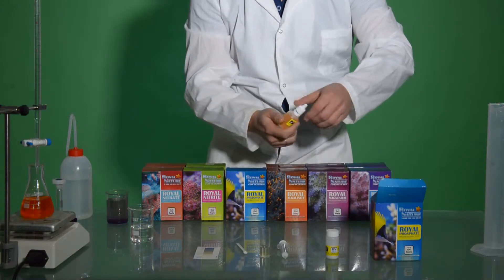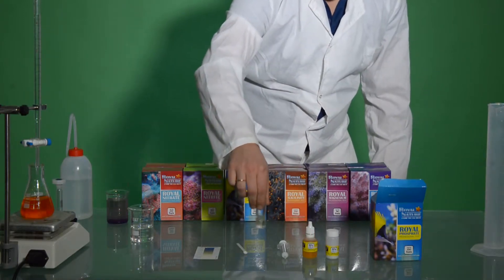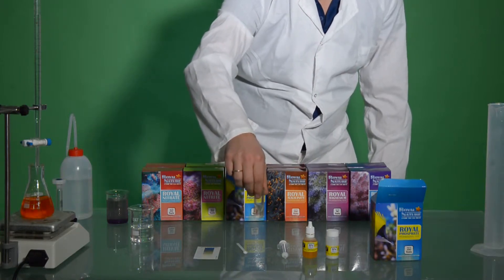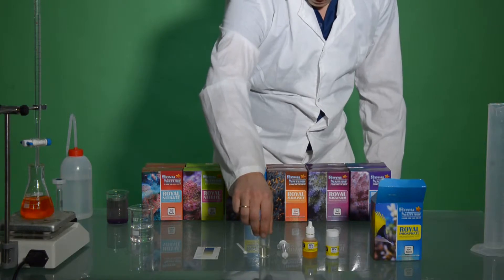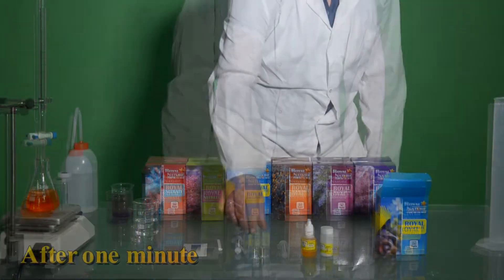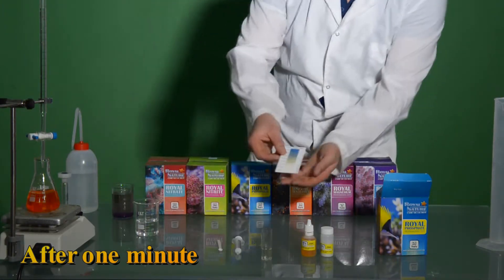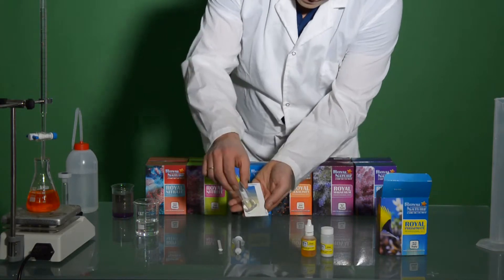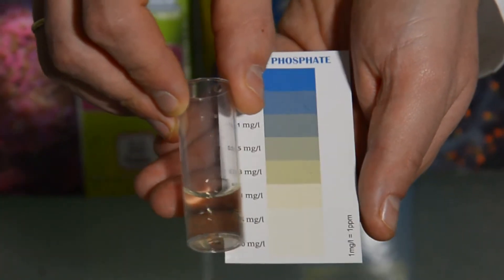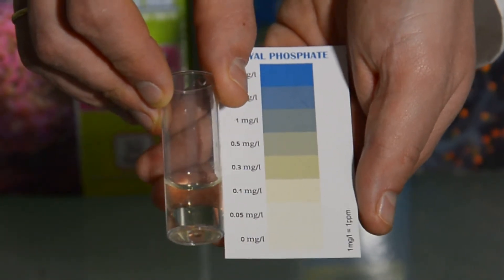Allow it to stand for 1 minute. We'll hold the Test VL next to the supply color chart, on a part of the chart which is white, and compare the colors looking from the side of the Test VL. Read the corresponding phosphate content.